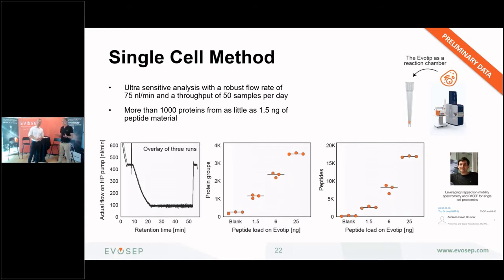Definitely. From my perspective, there are at least two comments. One is conceptually, when you think about how we've tuned our instrument, the configuration seems designed for something like that, because you have that preformed gradient and you have the one pump that delivers. Thinking about that, it makes sense logically at least. Whether it works or not is always different, but there's a logical argument that this may work. To be honest, in hindsight, it makes a lot of sense. In hindsight, everything makes sense.